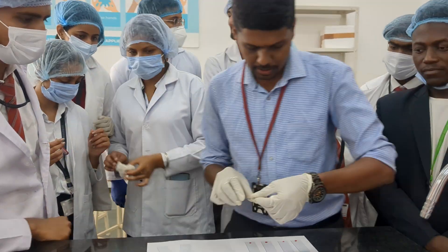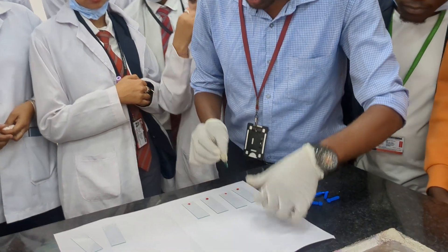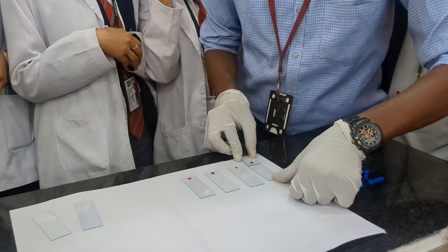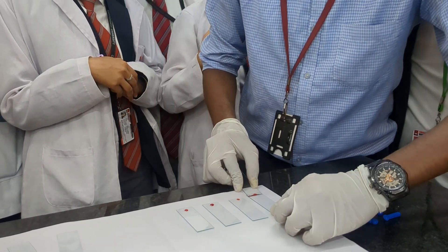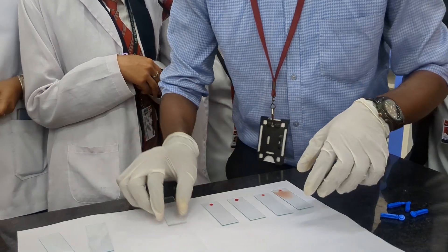Take a slide. Now this is very important. Bring the slide backwards — there are some squeezes here. Bring the slide backwards. Let the blood spread evenly. Once the blood is spread, go forward. You got a tongue smear.